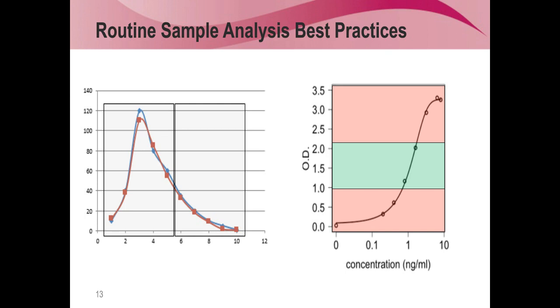And of course, you are not really interested in showing the PK profile perfectly. You're really only interested in the difference between those. So that means, for example, when you have 96 wells available minus, of course, all the QCs, you end up with 15 or 16 slots, so to speak.